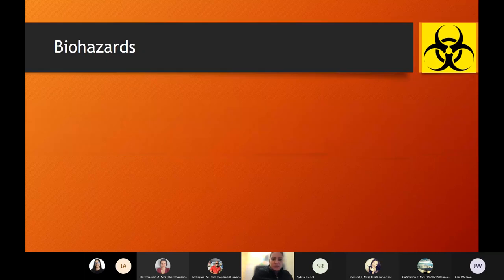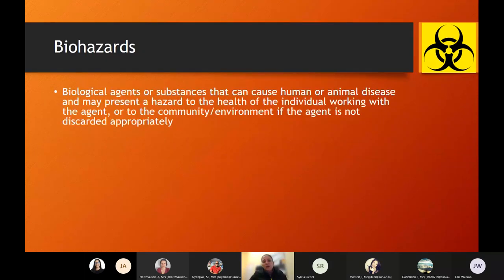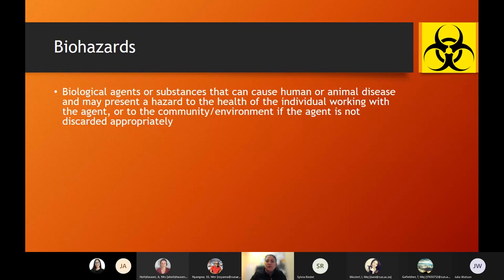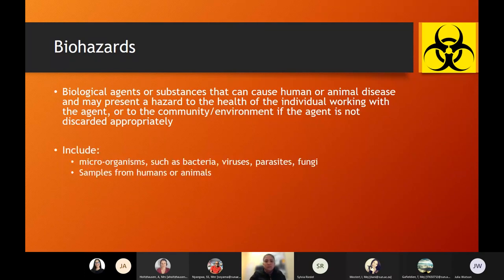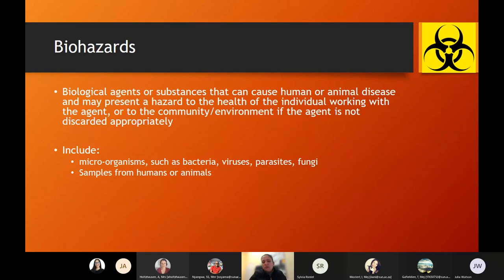Biohazards include any biological agents or substances that can cause human or animal disease and may present a hazard to the health of the individual working with the agent, but also may be hazardous to the community or environment if the agent is not discarded appropriately. These biohazards could include microorganisms such as bacteria, viruses, parasites, fungi, yeast — but also samples from humans or animals that you might not be aware are infected, which could easily carry bacteria, viruses, parasites, or fungi.